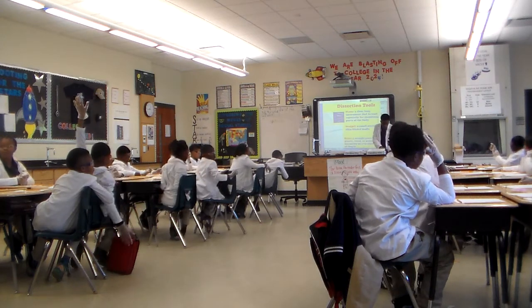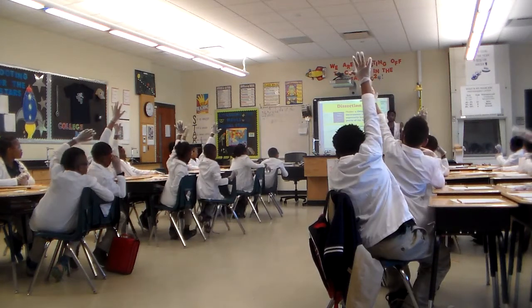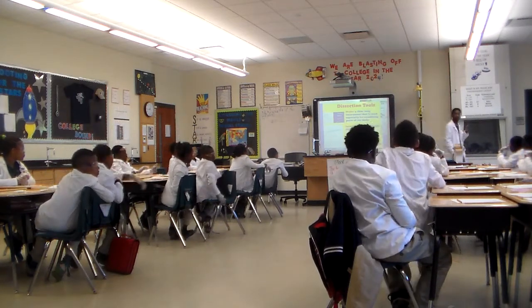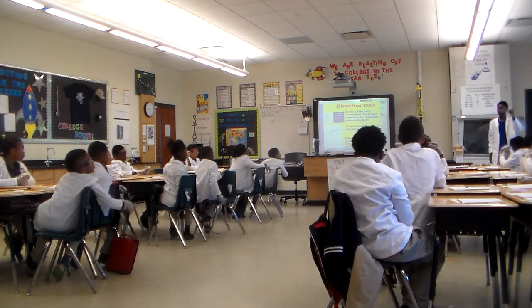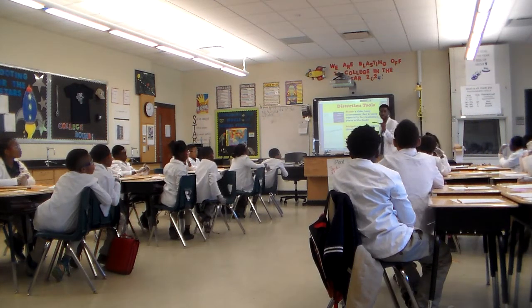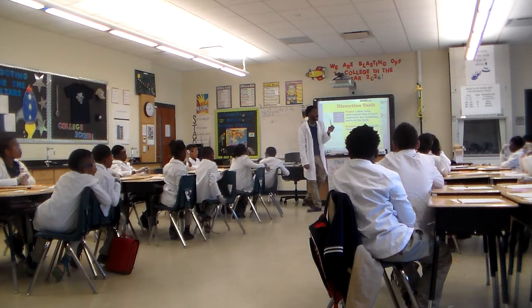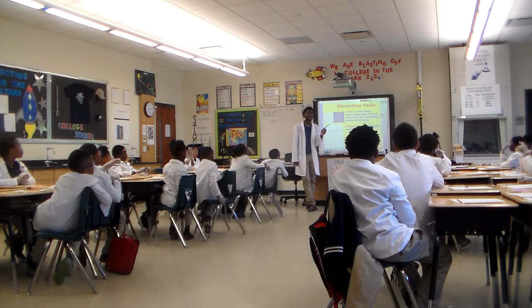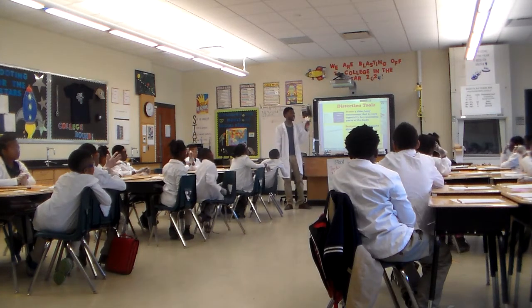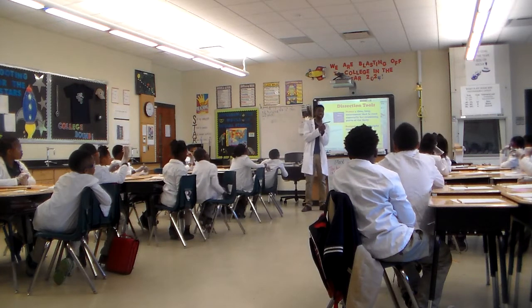Yeah, so here's the scalpel, you guys. Who can read the definition of scalpel for Mr. Lawson? Trey Young. A small, straight, thin, bladed knife. A small, straight, thin, bladed knife, right? This is a real knife, you guys. But I'm more than sure that you guys are going to be more than careful with it, right? Mr. Lawson isn't going to turn this over to you guys just yet, right?